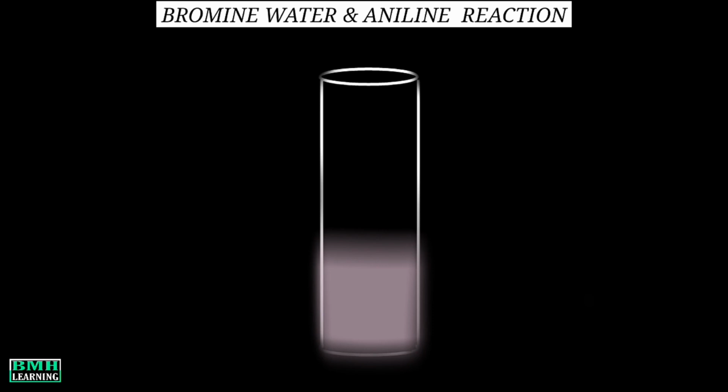So the reaction doesn't even need a particular temperature and catalyst as it occurs in room temperature or even colder temperature thanks to the presence of NH2 group.